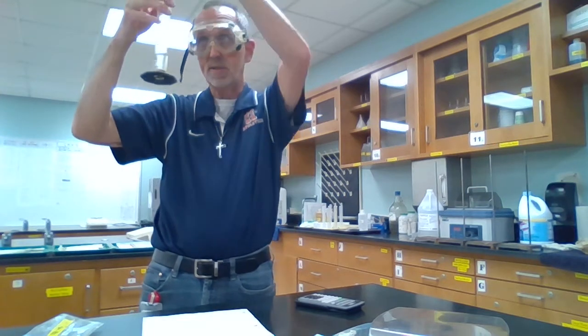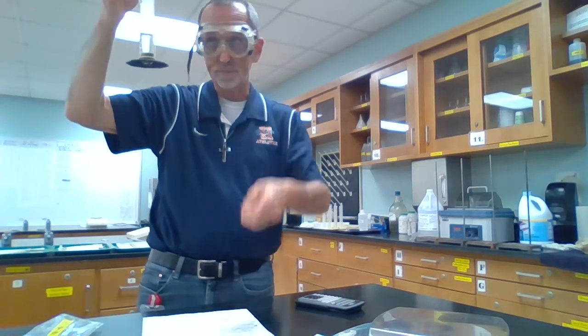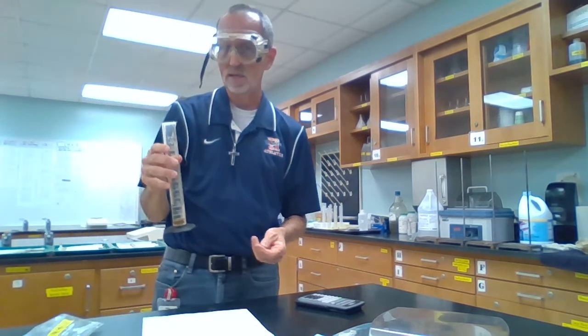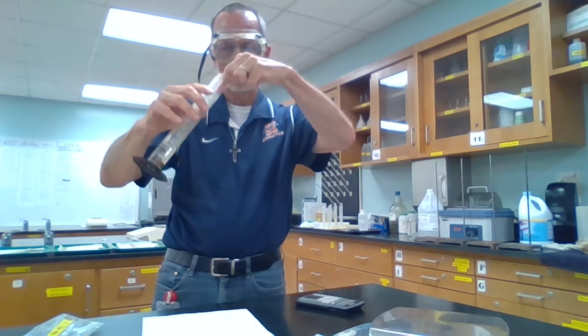Now we're going to 5, so I'll add 2 more. 1, 2. Try not to splash any water out. Don't want any air there. 5 pennies. Looks like we're going right up about 2 mLs, so 2.0 mLs for 5. Need to add 2 more to get us to 7. Okay, I'd say we're right at about 2.5 mLs. Yeah, it's about halfway between. 2.5. And then 2 more to get us to 9 pennies. And now we are sitting right at about 3.0 mLs volume.